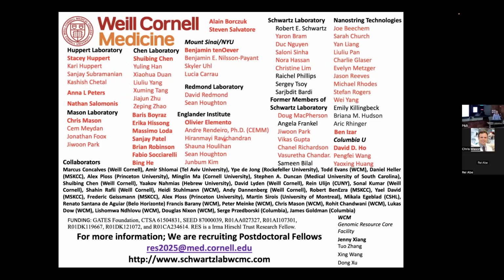I don't know if there's an answer to this question, but how do you deal with the trade-off between the really high resolution and the amount of area you can cover? Because I saw you had a ton of images, right? I think you're asking a few different questions. Each of the technologies has its own different liabilities, advantages, and things like this.